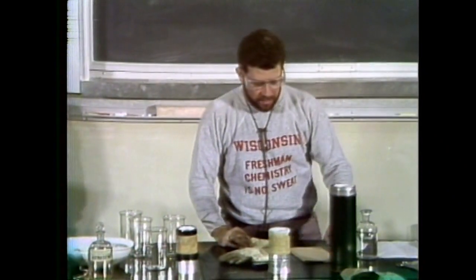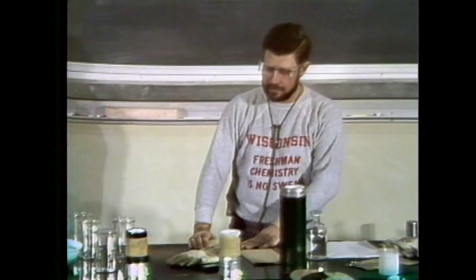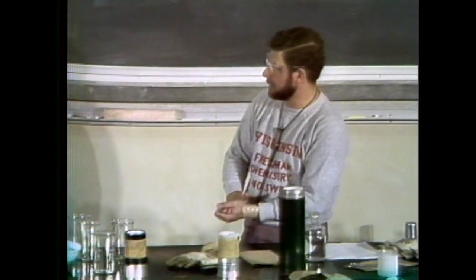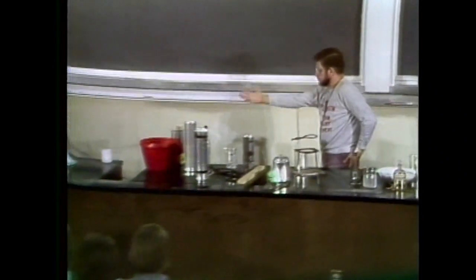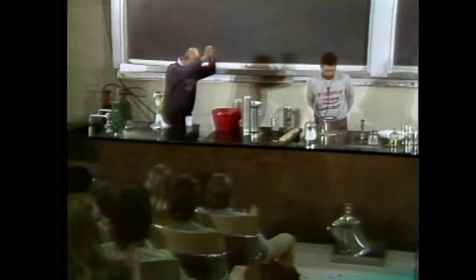The season that's coming upon us, as you know, is the holiday season. And I'd like to ask our lecture demonstrators to come out again and salute the holiday season for us. And I'd like to ask Tally to come out and do, well, Mr. Taliaferro. May I have the phenolphthalein? Certainly.